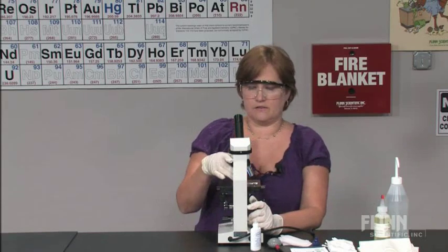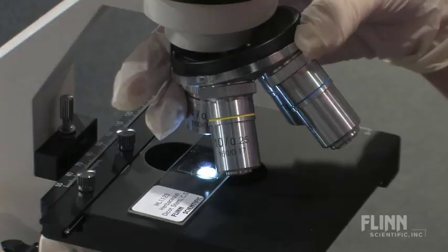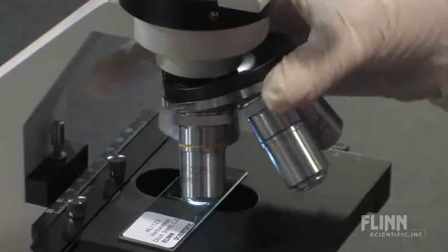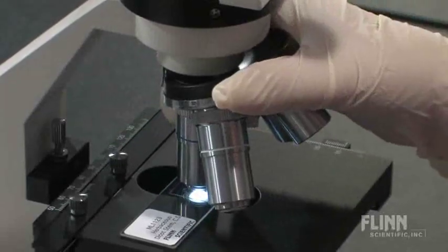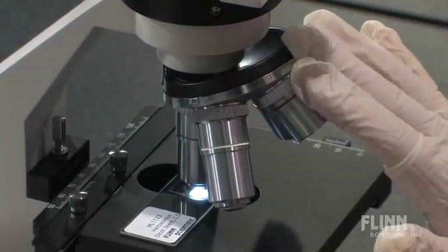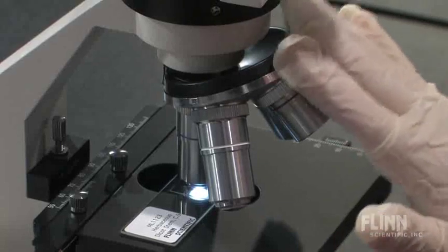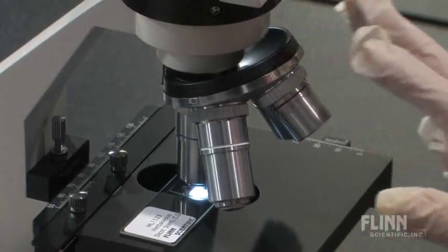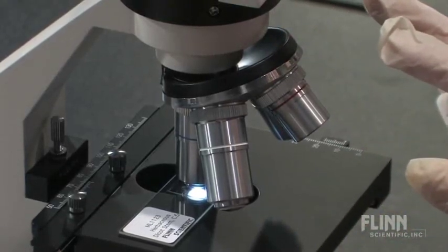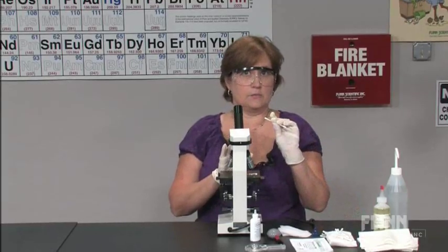If the dirt is on the objective, and that often happens, you're going to rotate the objective away from the sample. And in the case of low power, the objective is usually concave instead of convex, so you're going to want to use a simple cotton swab.